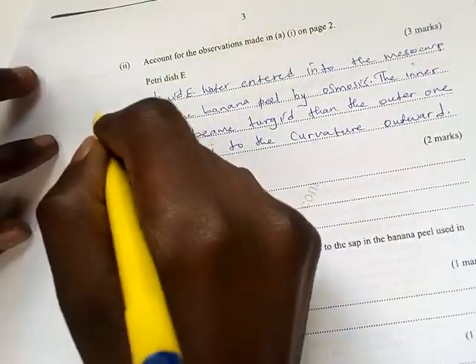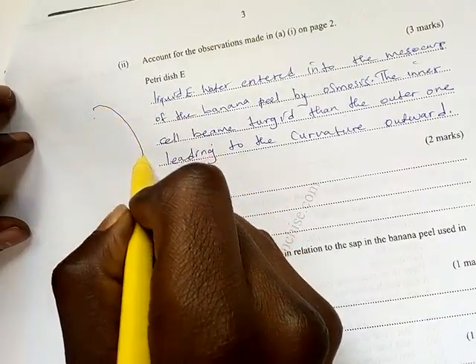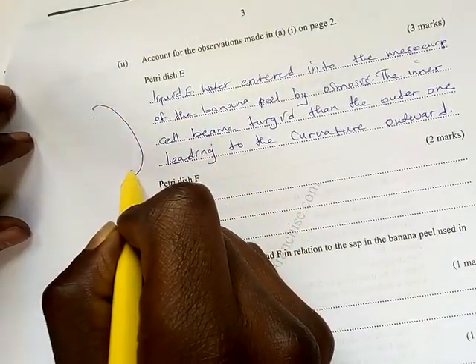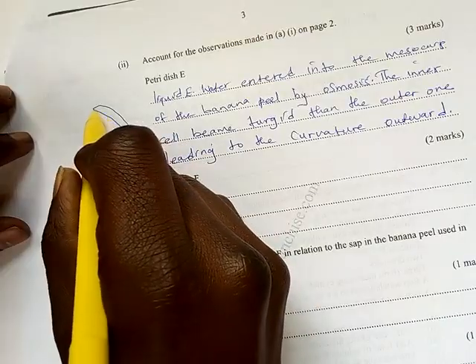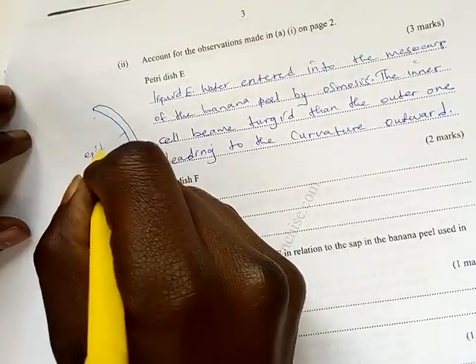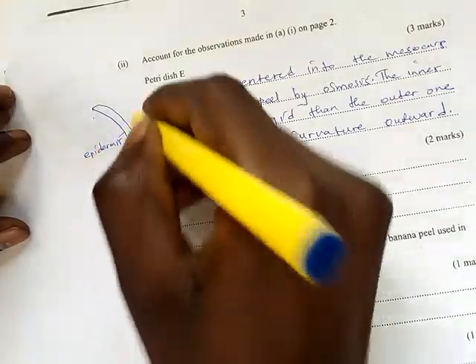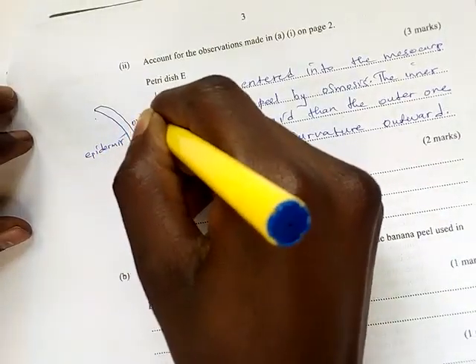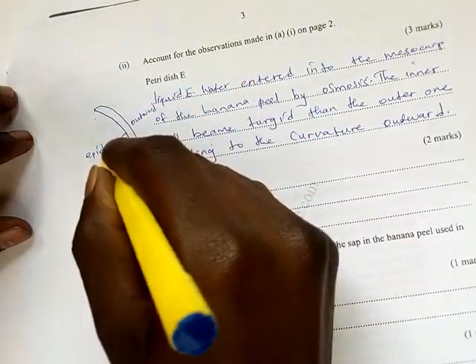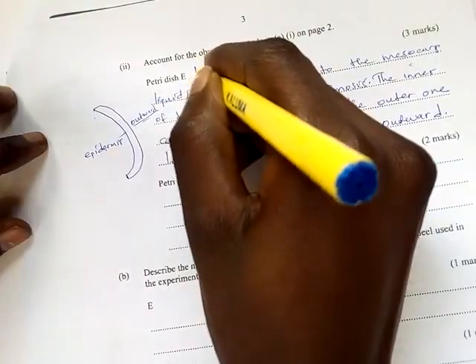Now the strip looked like this, peeled outward. Now this is the epidermis. The epidermis, you should know, has a cuticle which is waterproof. Now the epidermis has peeled outward.